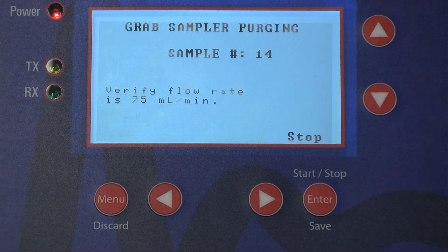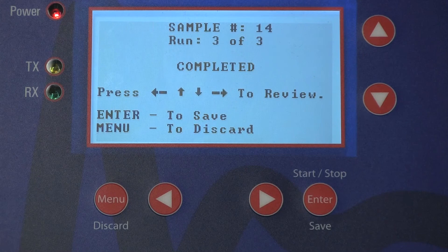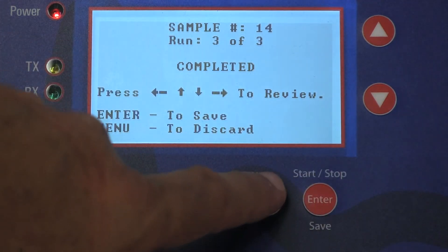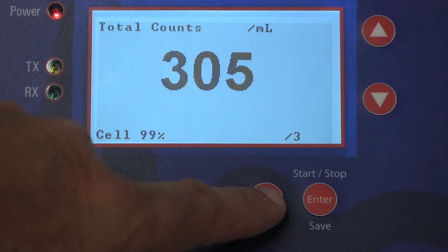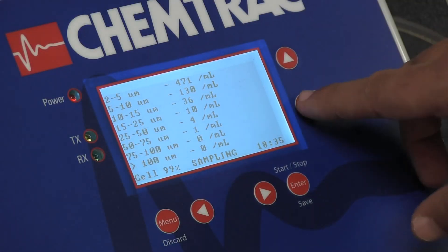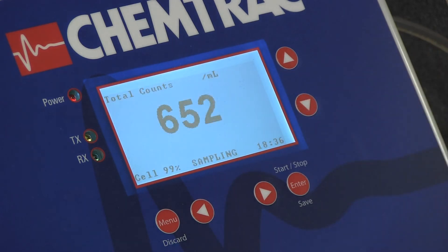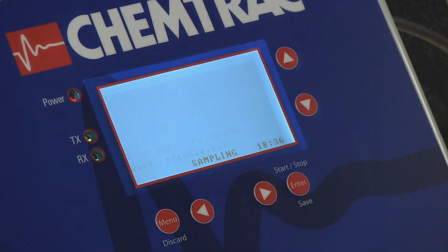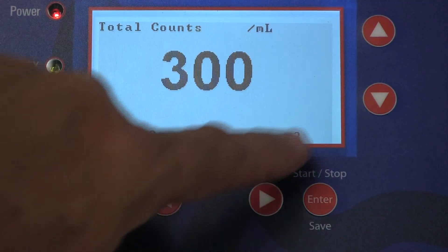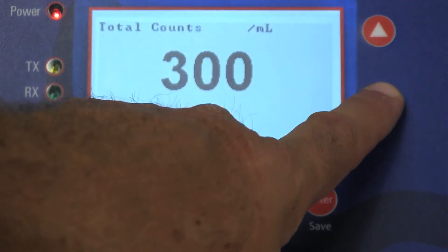Once the purge occurs, the unit will begin the defined number of runs in succession. Upon completion, the results can be accessed using the keys. The right and left arrows navigate to the respective run results, and the up and down arrows allow for size distribution, total counts, status, and graph trend. The analyzer gives very repeatable and consistent results.